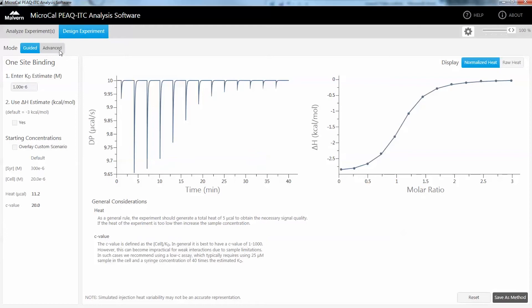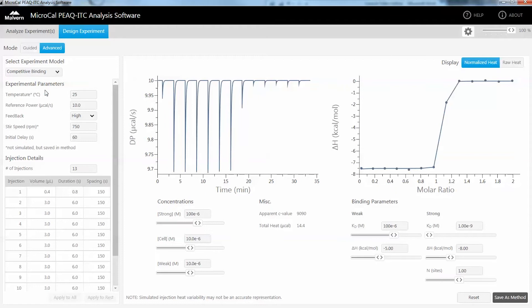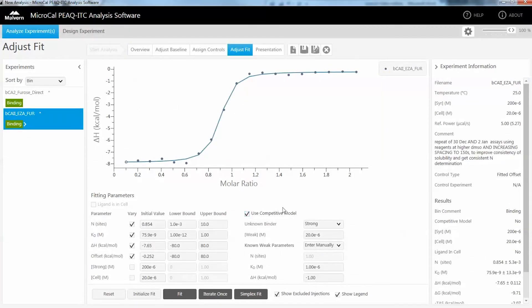If you would like to measure really tight affinities or weak ones, you can take advantage of our experimental design workspace and optimize run conditions for competitive titration. Here you can adjust the amount of weak binder loaded into the cell to affect the apparent C value of the experiment. After completing the experiment, the MicroCal PEAQ ITC analysis software provides straightforward tools for analyzing competition assays, wherein you can specifically reference direct titrations in the same project.